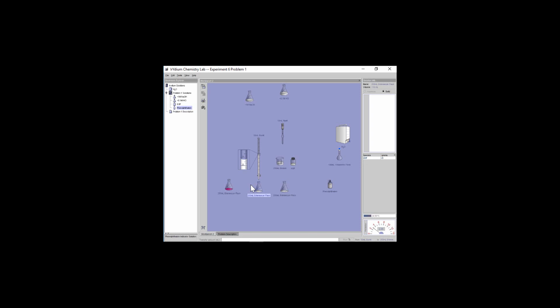I'm going to take my initial volume. I'll copy all these numbers down for you later on as well. 21.26 plus or minus 0.05. I know it was at least 10 milliliters. I'm pretty safe with, let's say, dropping in 8 milliliters. So maybe either in increments of 8, I can still do it. So I recorded my initial volume, I can pour it in 1, 2, 3, 4, 5, 6, 7, 8. Or you can even just type in the 8.